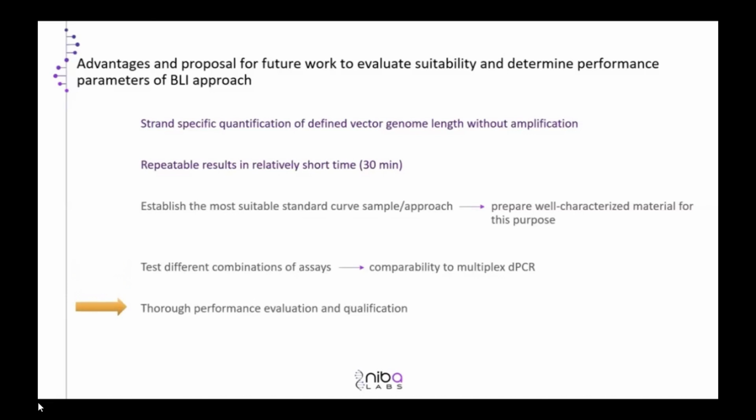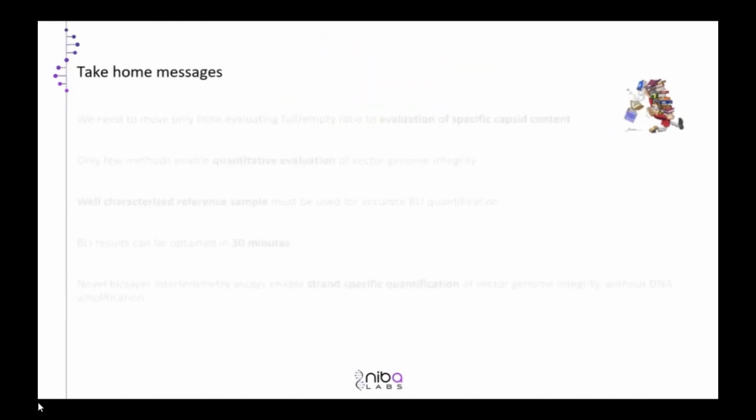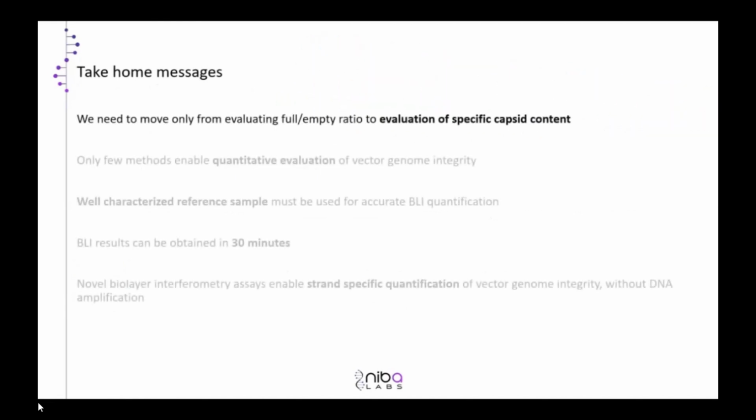So that brought us to the take-home messages, and I hope that I've shown you that we need to move from the full-empty evaluation to the specific capsid content.